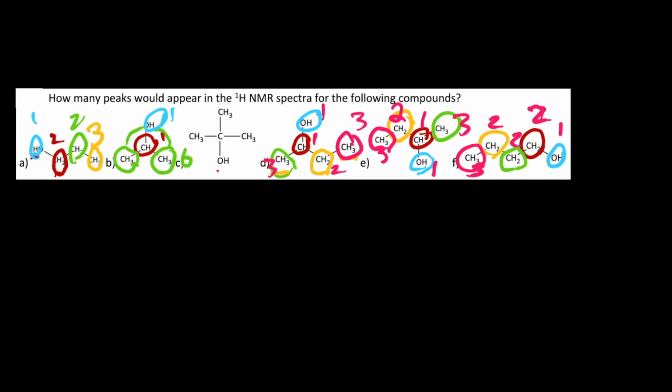All right, let's come back to this one. You might think that these are equivalent and this one is different, since these are 90 degrees and this one looks like it's 180 degrees, but of course that's not correct. That's drawn flat, but that's not really what this looks like, right? Let's draw this out. So we have the alcohol on a carbon, and we have a tetrahedral shape around that carbon.